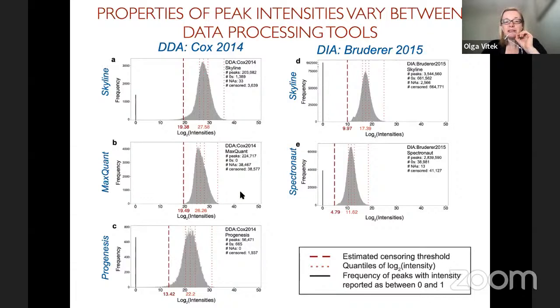And so what we realized when we worked with all of these data processing tools is that we should not be interpreting this type of readouts literally, because sometimes the same pattern in the data is represented in very different ways by different tools. And they have their reasons, and sometimes they emphasize certain things.